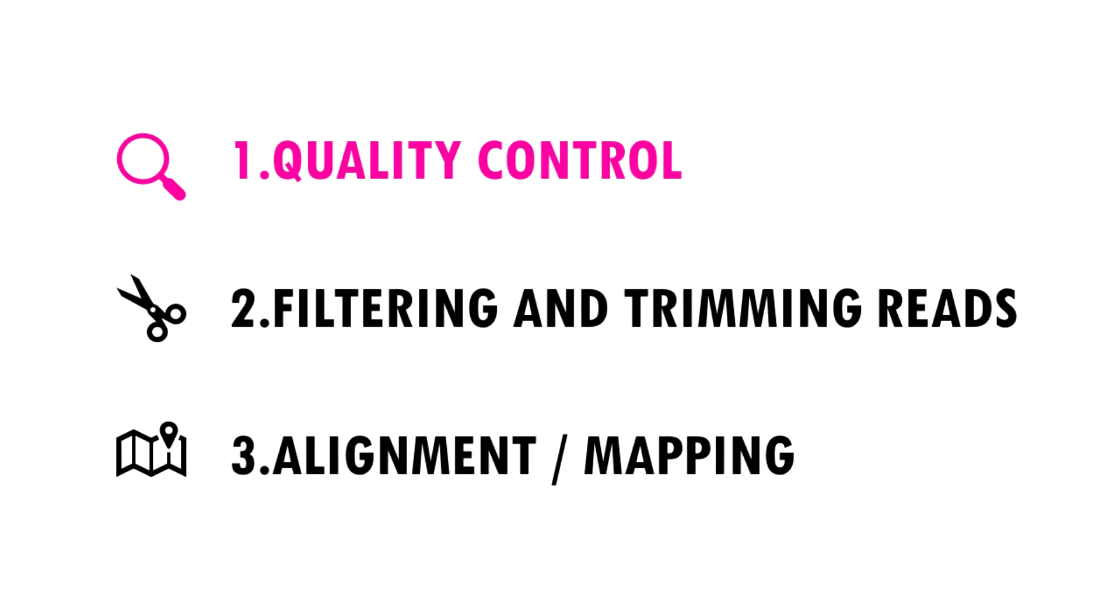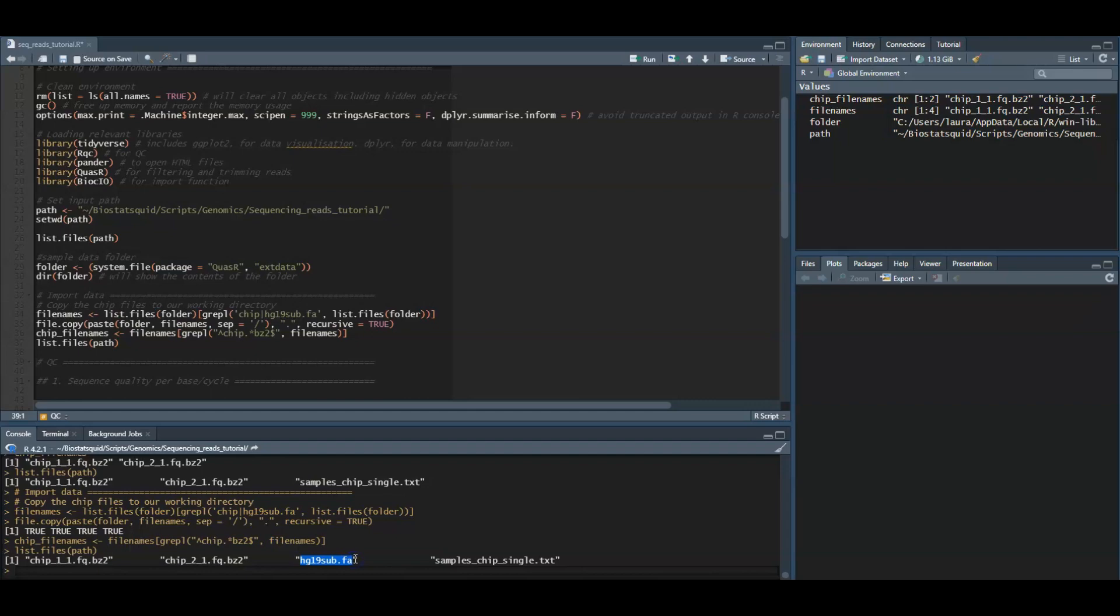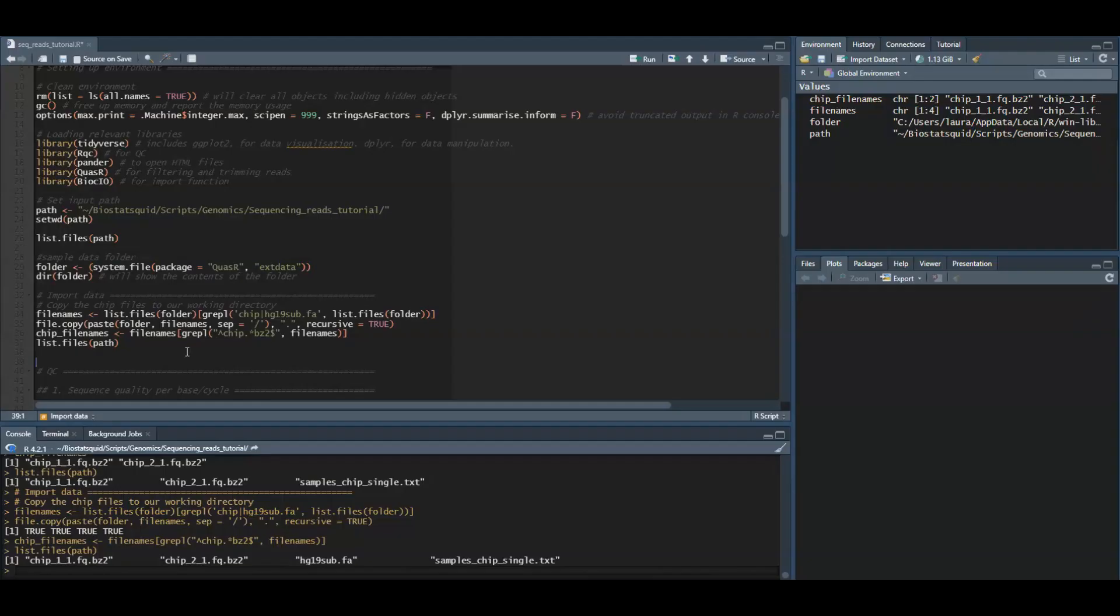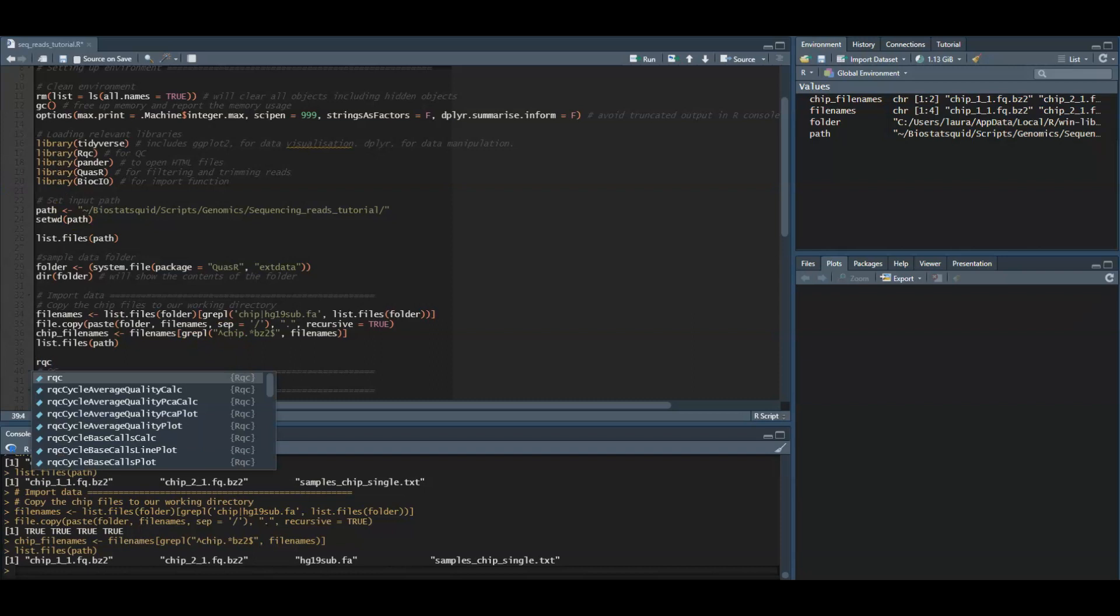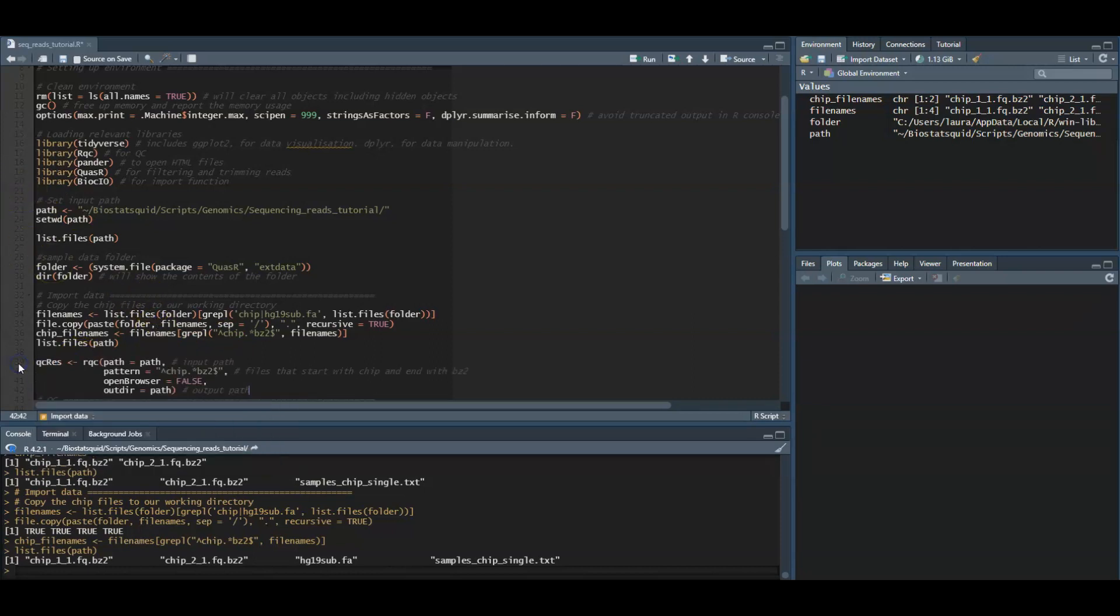When sequencing, the machine might produce base calls, basically deciding if the base reads A, C, G, or T, with different quality. Also there might be adapter contamination and other issues which we need to check. We will use the rqc function from the RQC package which takes the FASTQ files and returns an object with sequence quality related results.